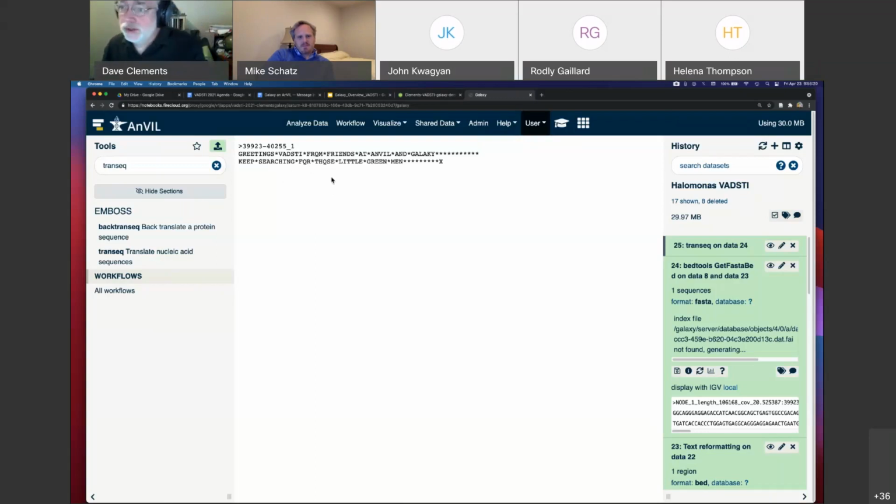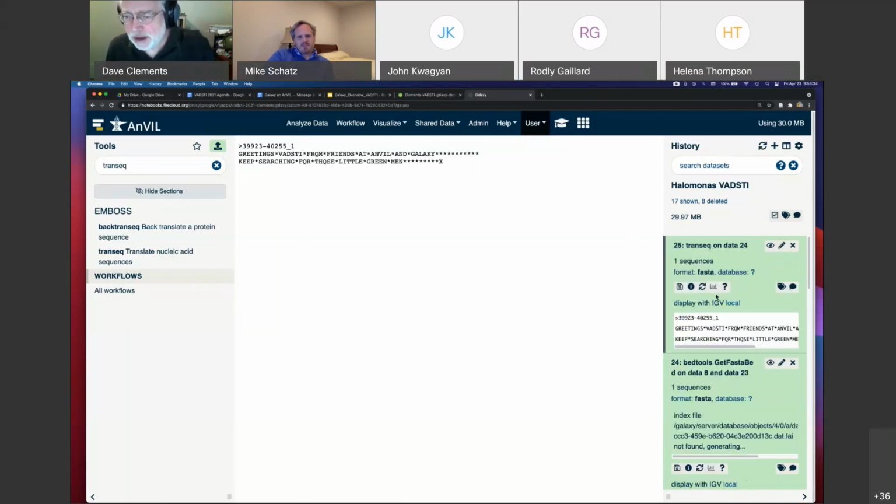Now, before we do any of the optional stuff, because I have time, what do we want to do with this? So we want to save our data so we have some results. And I'm going to argue, maybe I want to save this, maybe I don't. Maybe I should just save the DNA because I can always get this from the DNA. But I'm going to save this, the DNA, and the contigs are the 3 things I'm going to save.